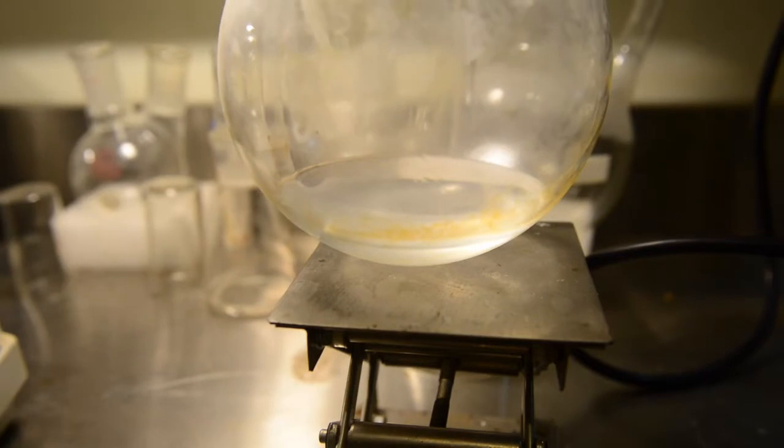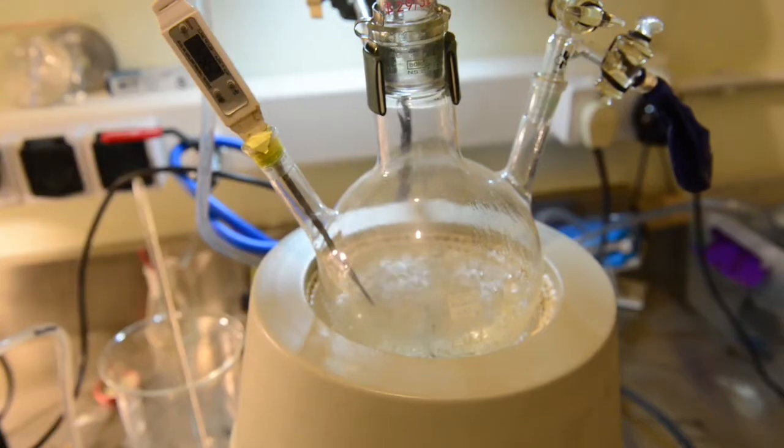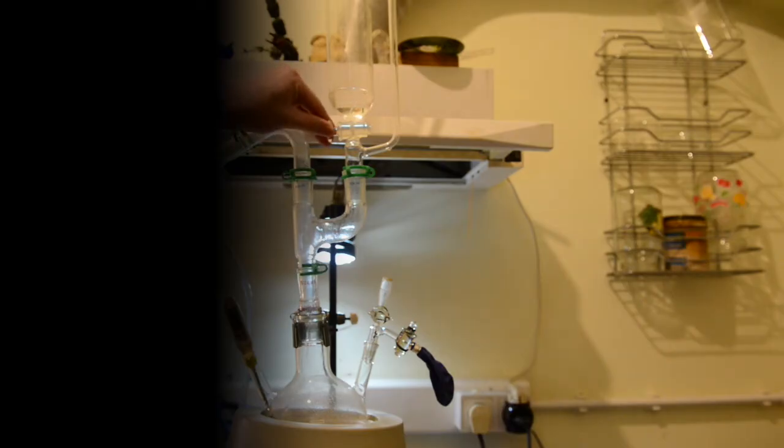In the receiving flask cloudy distillate is collected. Heating was continued until all the formic acid had reacted. After that, we had turned off the heating mantle and cooled the reaction flask down almost to room temperature.